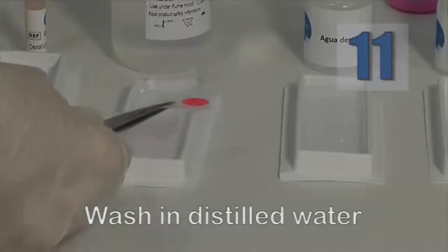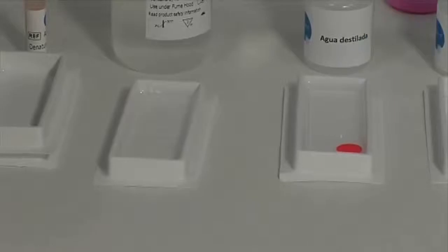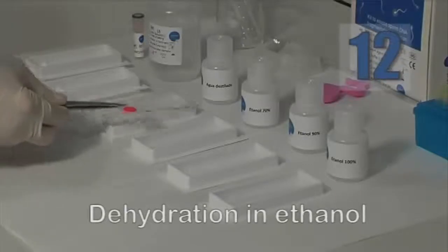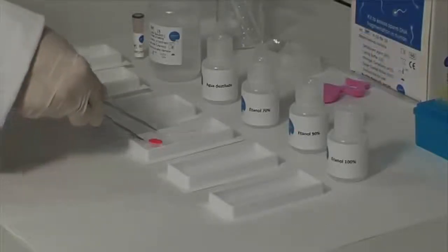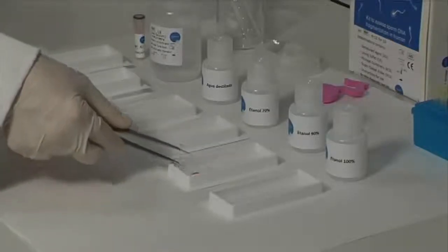Remove the slide from the lysis solution and wash in distilled water for 5 minutes. Then incubate sequentially in ethanol at 70%, 90%, and 100% for 2 minutes each to fix the sample.